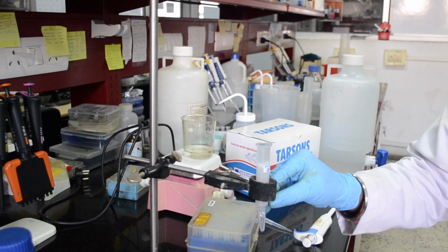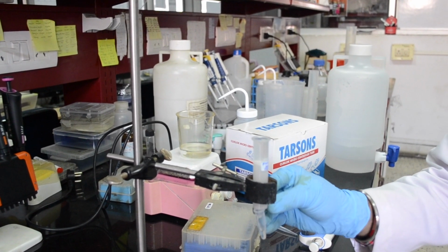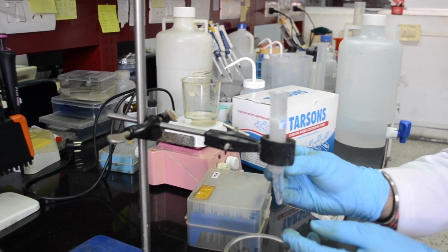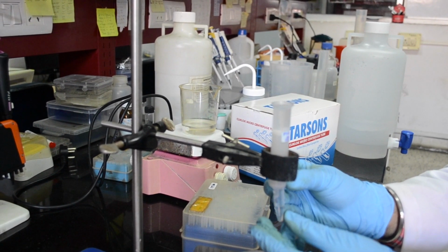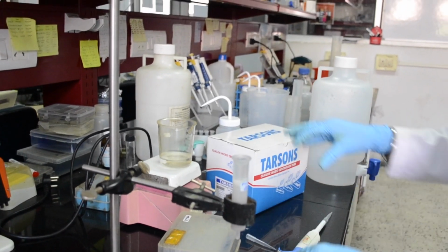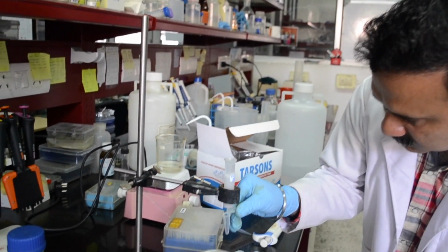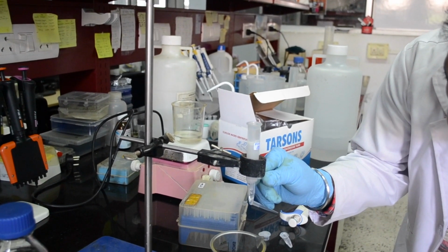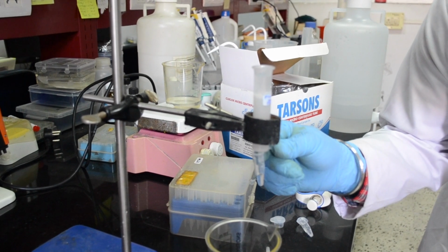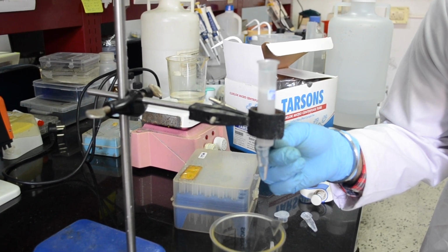You can simply collect the 0.5 ml fractions, and your protein will come out into these 0.5 ml fractions. I have collected fraction number 2, and in a similar way you can collect another 4 fractions.